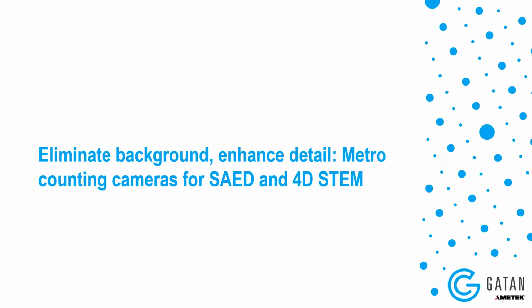Thanks, Jonathan. I'm excited to present today on how we can use the Metro counting cameras for both selected area electron diffraction, and I'll talk a little bit about 4D STEM. The Metro camera, like all of Gatan's counting cameras, really helps us to eliminate background intensity and then to enhance the detail. I'll talk more about what I mean by that as I go through these slides today.